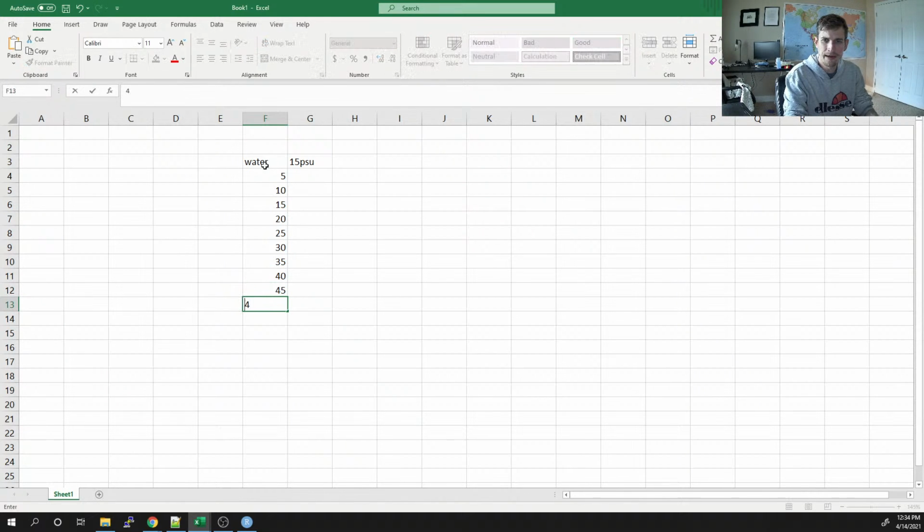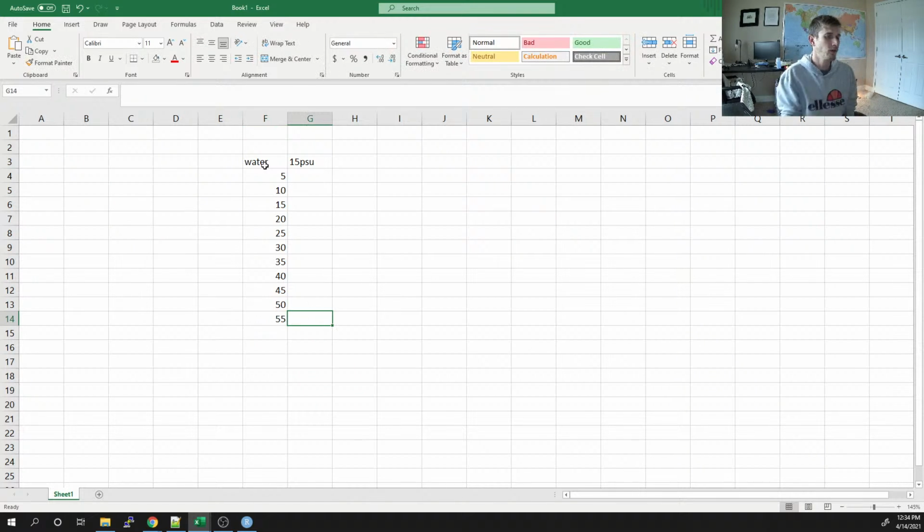I did this earlier today. I think 50 was good. There we go. Okay, so let's say these are our water means, expression of different genes, hypothetical, that vary between 5 to 55.